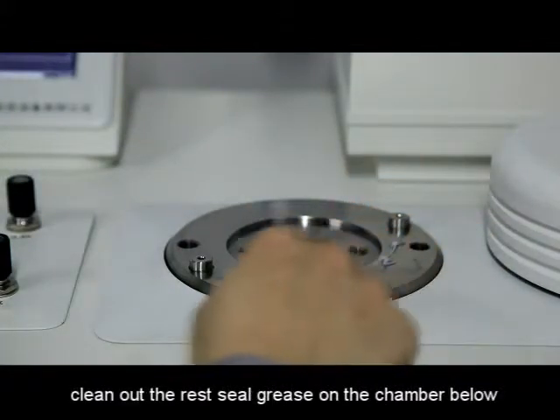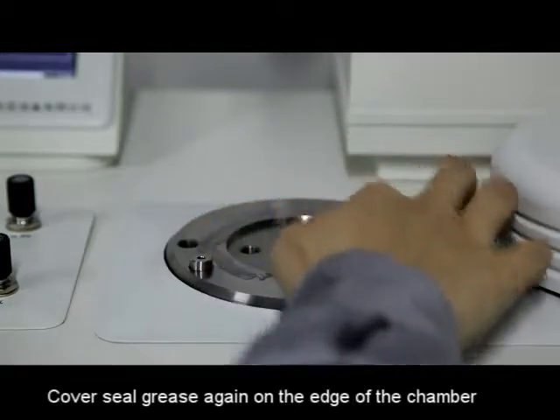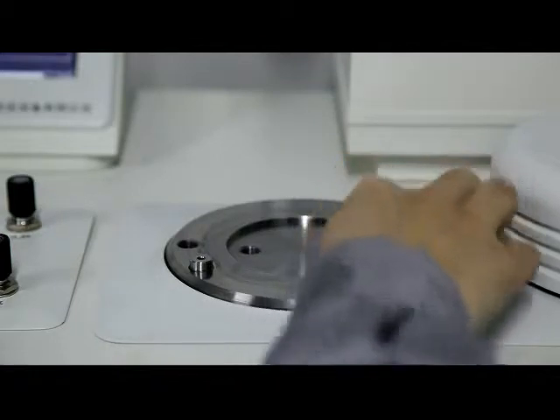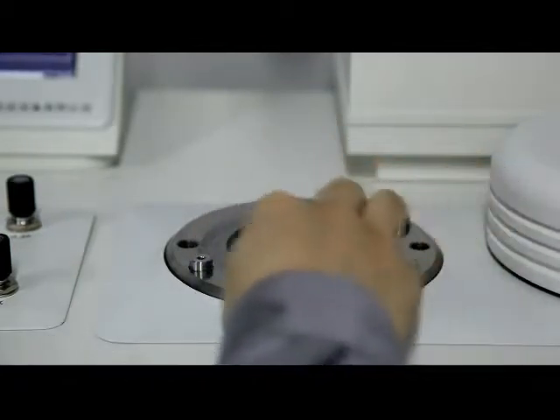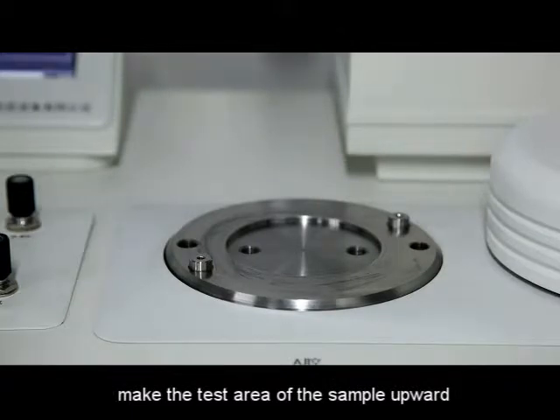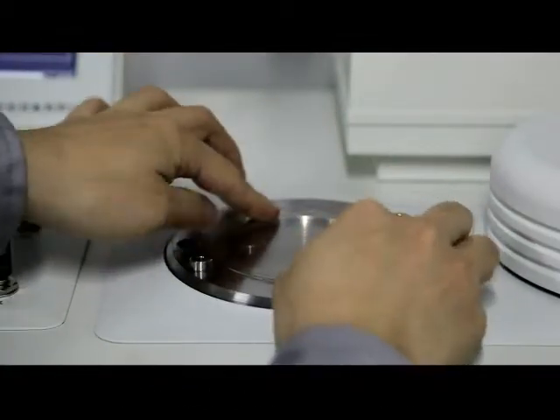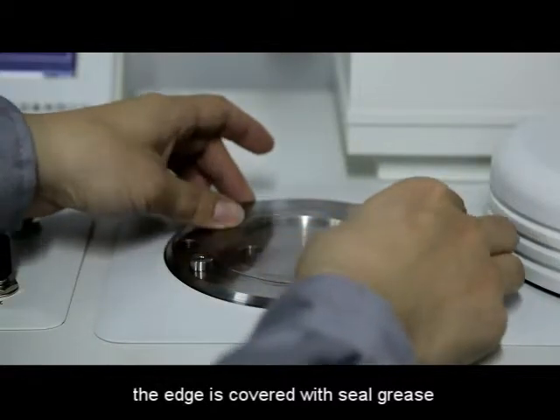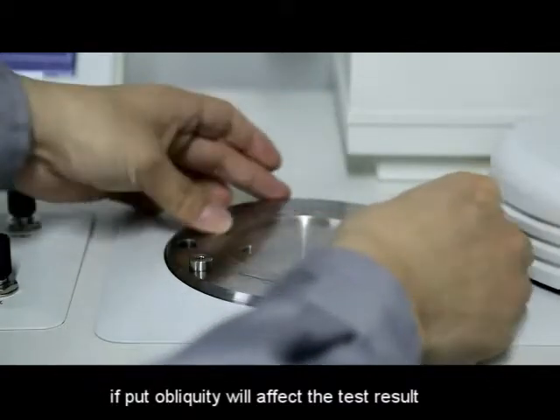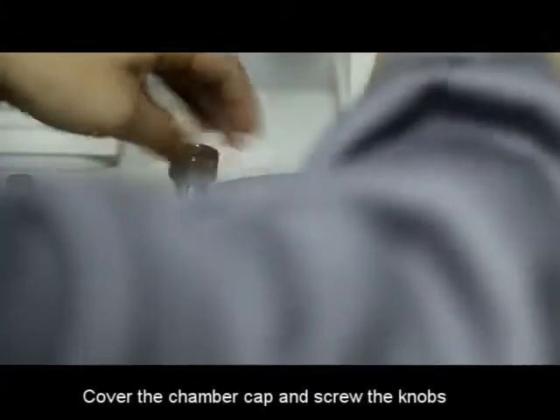Open the chamber cover and clean out the remaining seal grease on the chamber below. Apply seal grease again on the edge of the chamber. Use the right hand to hold the sample film, with the test area facing upward, and softly place the underside of the film onto the edge. The edge is covered with seal grease. Caution: the sample film must be set straight — if placed obliquely, it will affect the test result. Cover the chamber cap and screw the knobs.